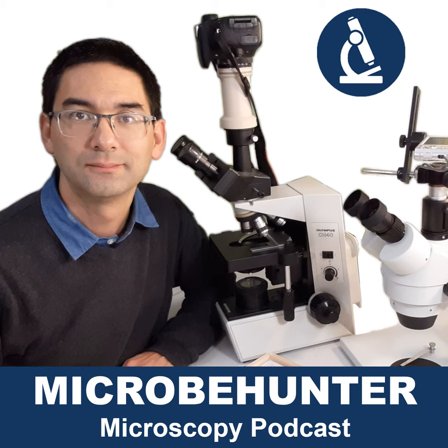So first of all, let's start off. Both compound and stereo microscopes are used by amateur microscopists, and sooner or later, if the hobby really captures you, then most likely you're going to get both of these types. Compound microscopes generally give a higher magnification, and they are used for specimens that are small and transparent. So if you want to look at individual cells, for example, or at algae that you collected from pond water, then a compound microscope is probably more suitable for you.